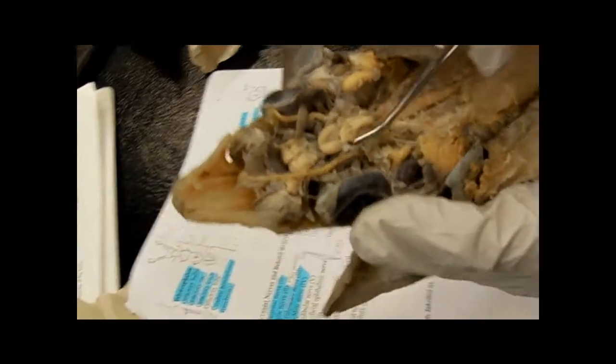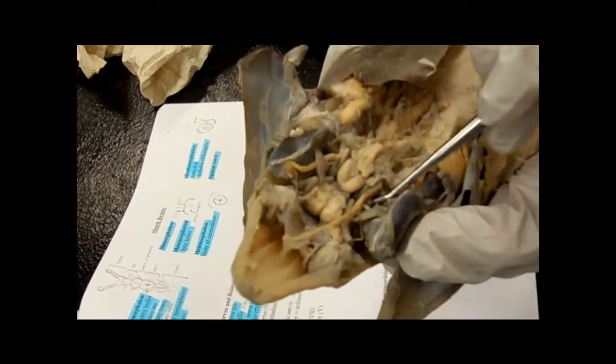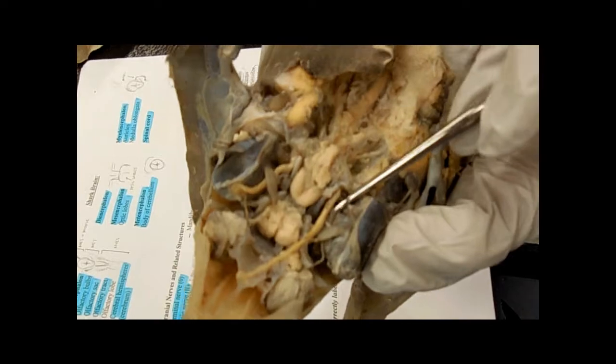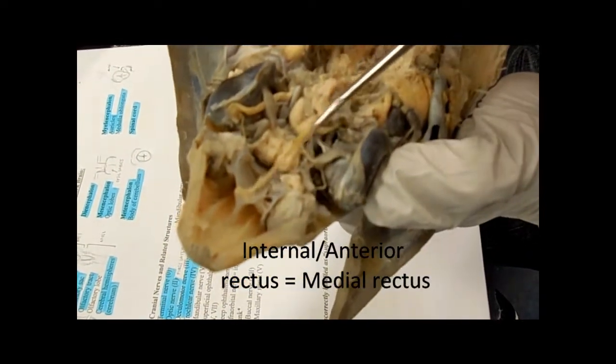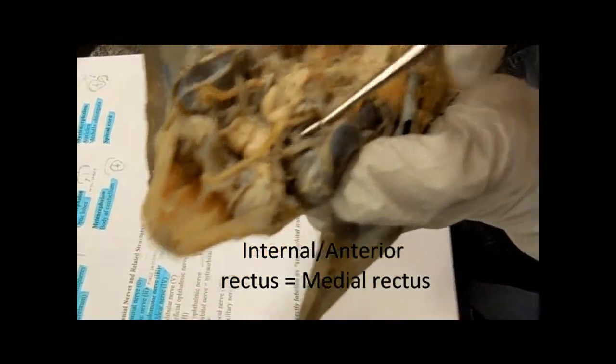And then the middle section is like right underneath these two. You get this one that kind of folds over, this is the anterior rectus. Let me move this guy out of the way a little bit. I don't want to try that.